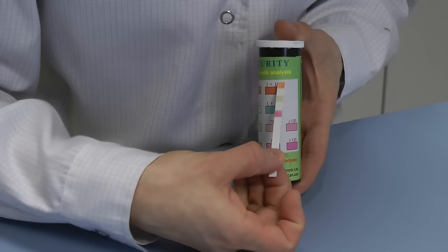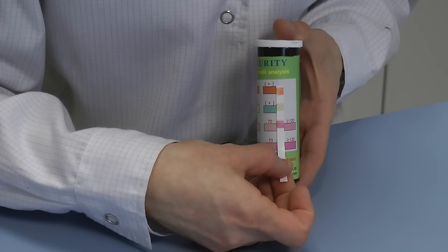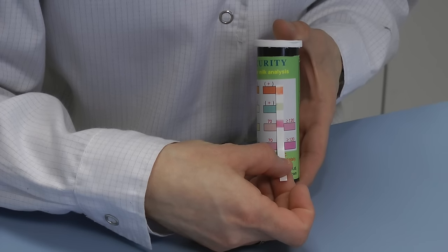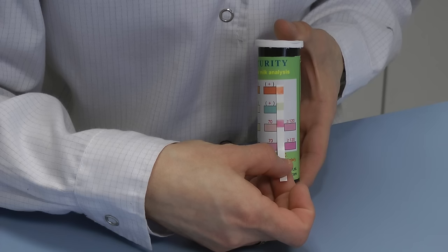When there is adulteration with urea, the third, last indication area is changing its color from yellow to pinkish red.